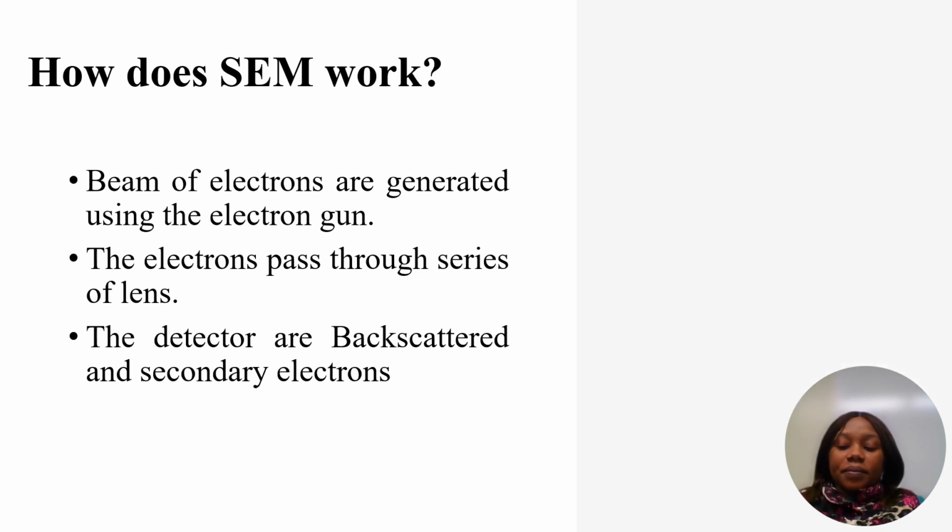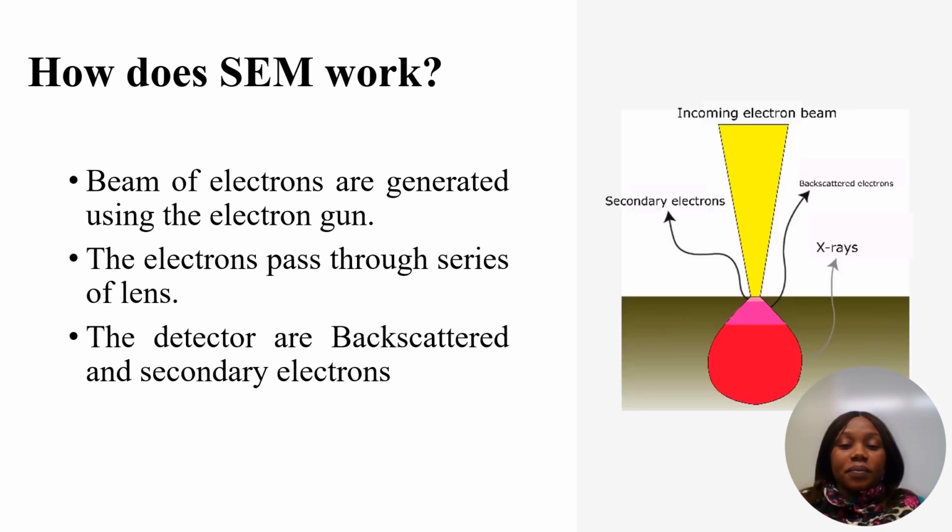While the X-ray detector is as a result of the beam knocking out electrons from the sample. So this is the picture to show these different detectors.